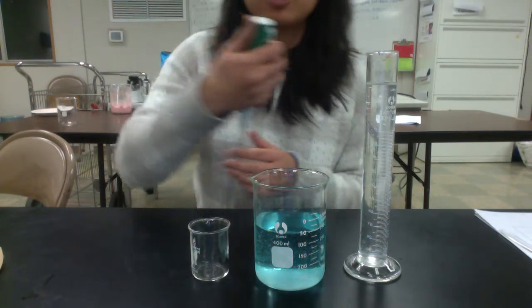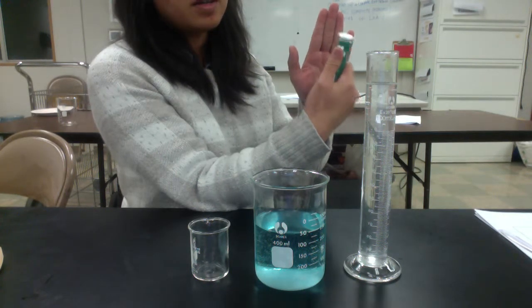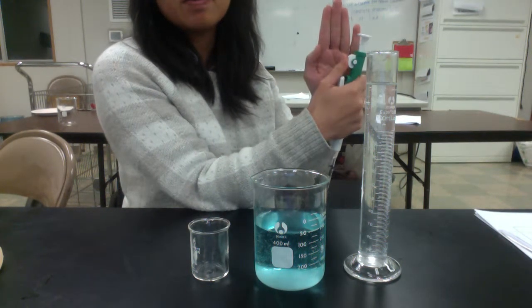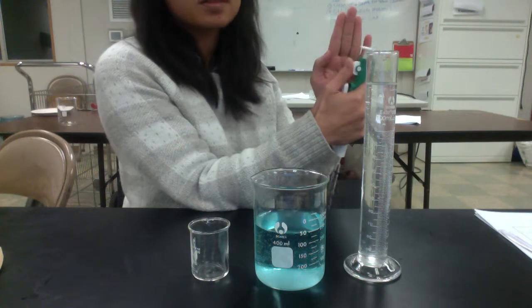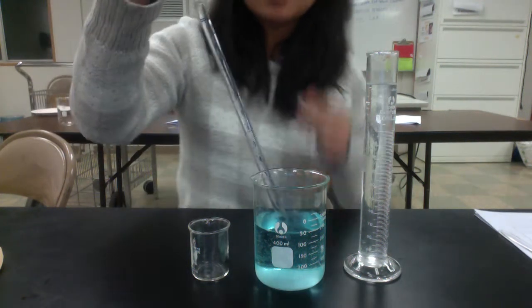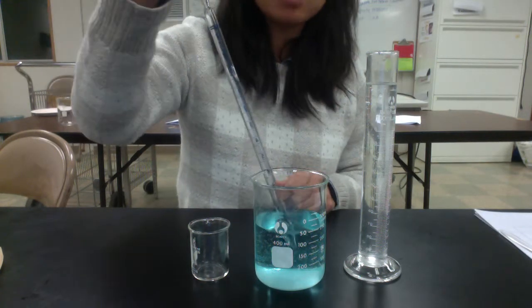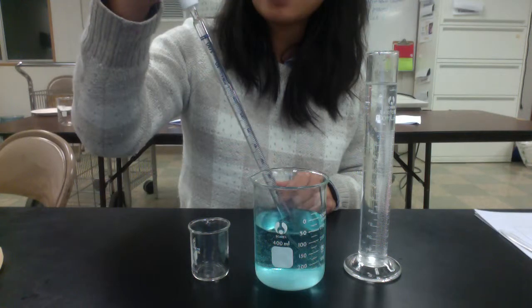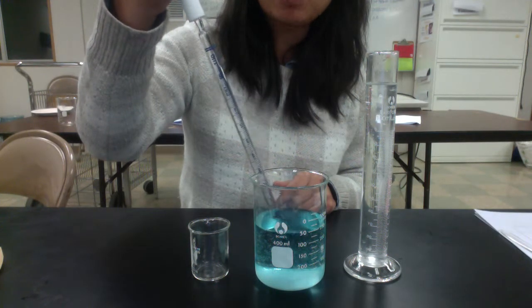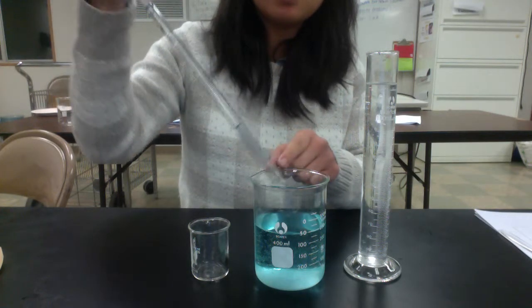It's hard to show the camera, but my thumb goes up and down behind this. If I need to suck up liquid using my pipette, I'm going to insert the tip of the pipette into the solution, and then I'm going to roll my thumb in a downward motion. And that will suck up any liquid that I need.